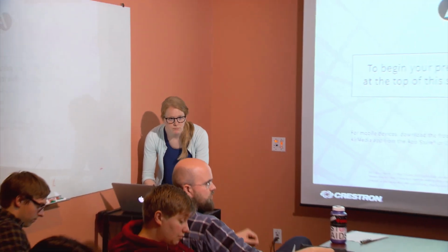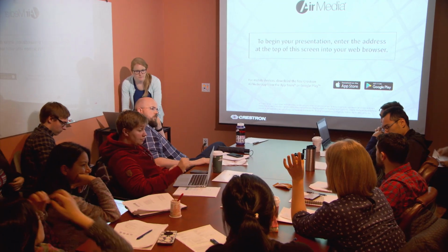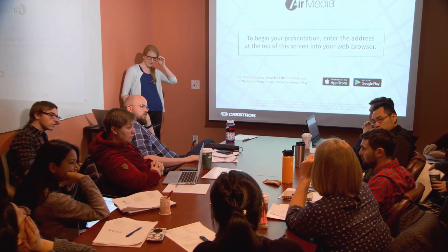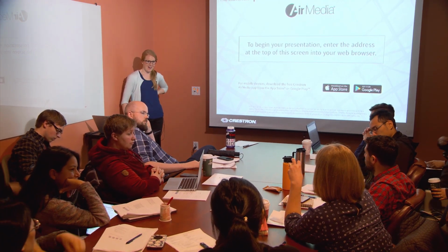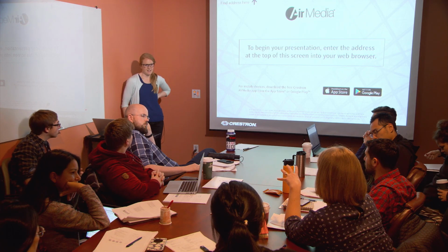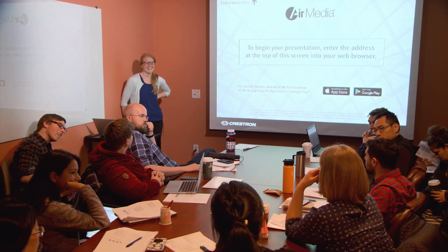Okay. Can I ask a question? Yeah. Just practicalities of the actual nucleofection part. Obviously, as we're being taught to passage cells, it's all about keeping them in clumps, never have single cells, they won't stick, they won't grow. So when you're actually nucleofecting these cells, are you doing so when they're growing in their colonies, or do you dissociate them first, and then afterwards, how on earth do you get them to grow?